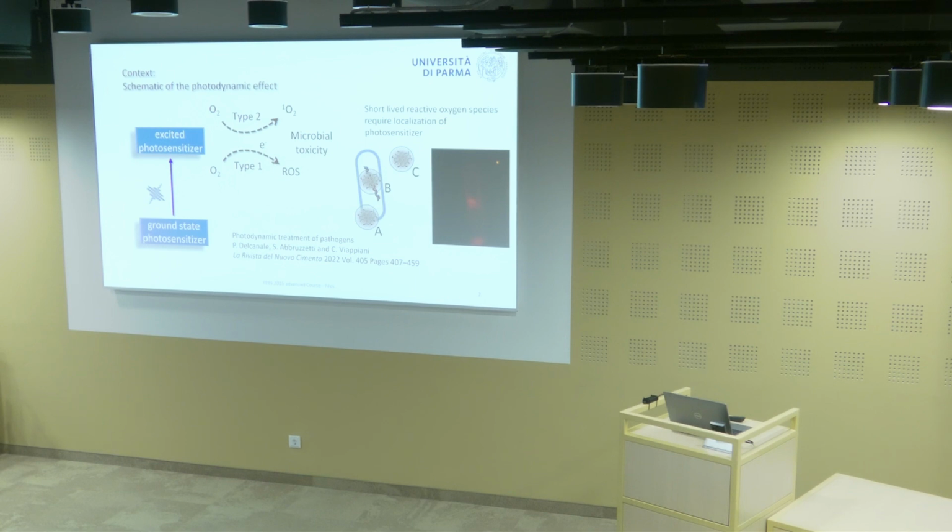Essentially, it's a very nice method because it relies on molecules that are versatile in their behavior, in the sense that they can be exploited also as fluorophores. And here you see an example of hypericin. It will be one of the tools we will touch repeatedly during the talk.